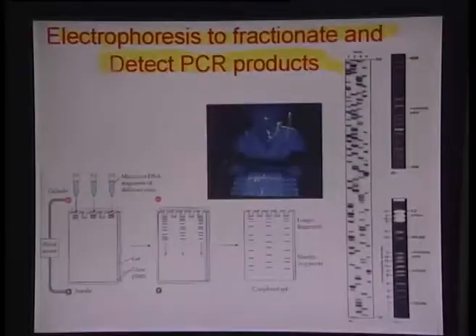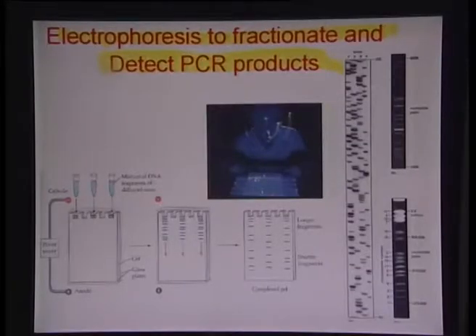A ladder essentially is the same concentration of different fragment lengths starting from, let's say, 100 base pairs all the way to about 1000 base pairs, with a difference of about 100 base pairs. So you have a solution, and these are commercially available in most of the companies which sell PCR based products or kits, and they are also known as DNA ladder technically.